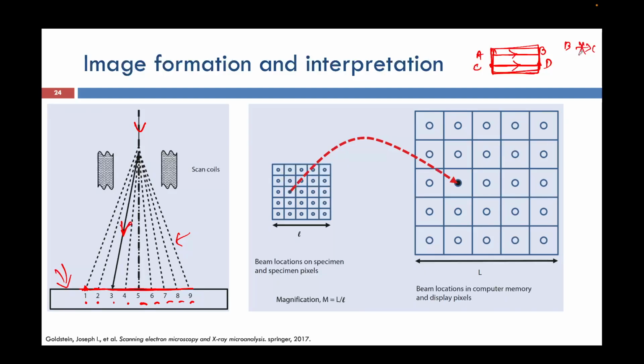And there is another term, which is known as magnification. When scanning happens, how do we know that scanning is happening?